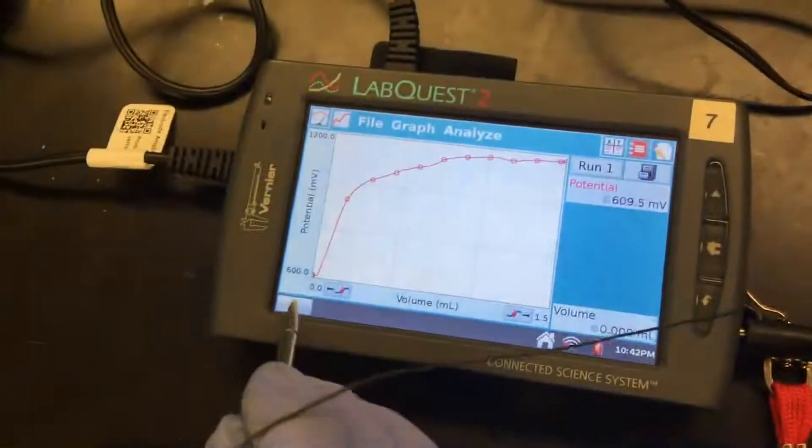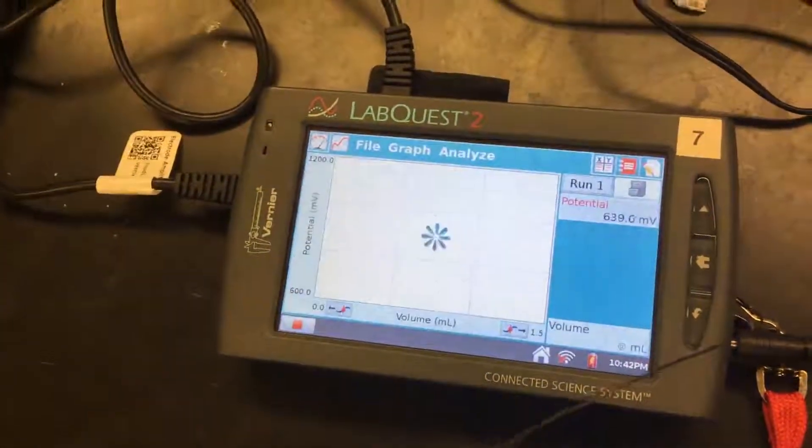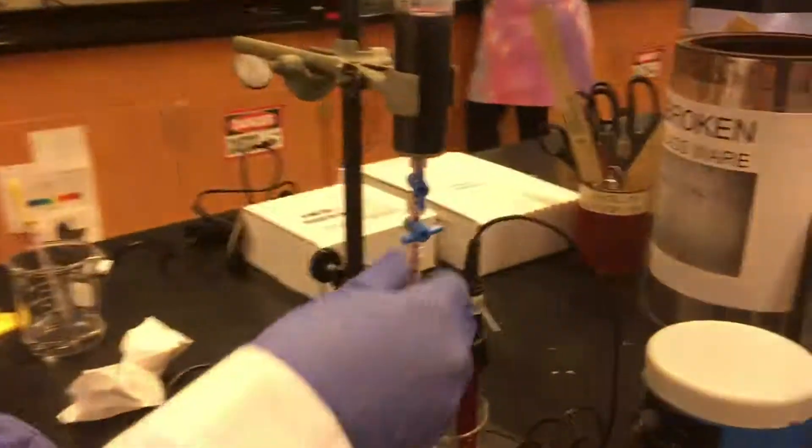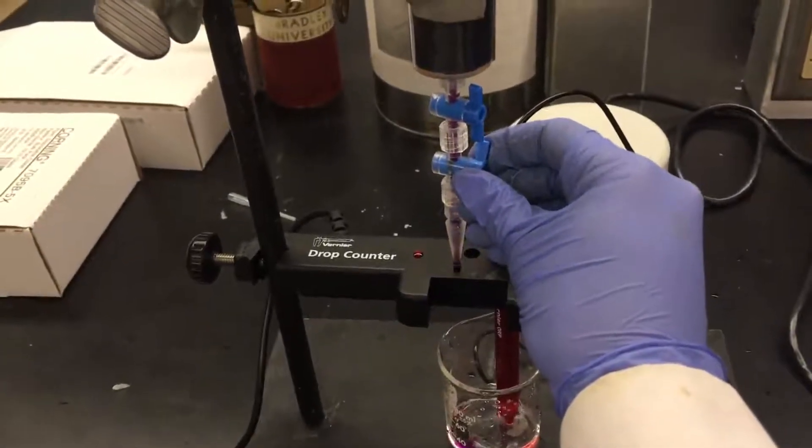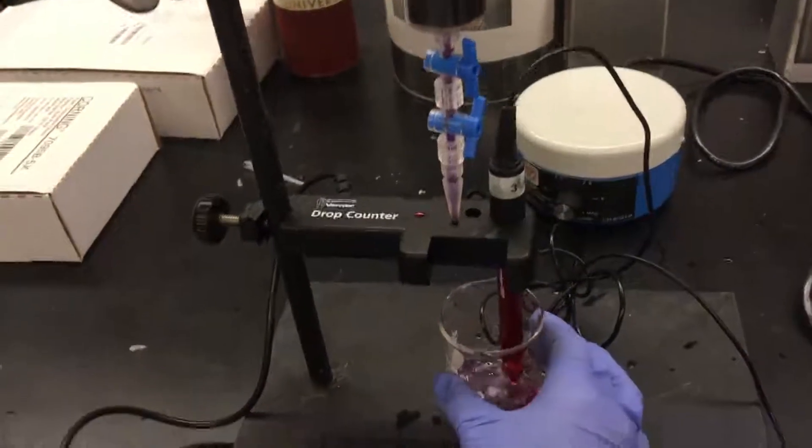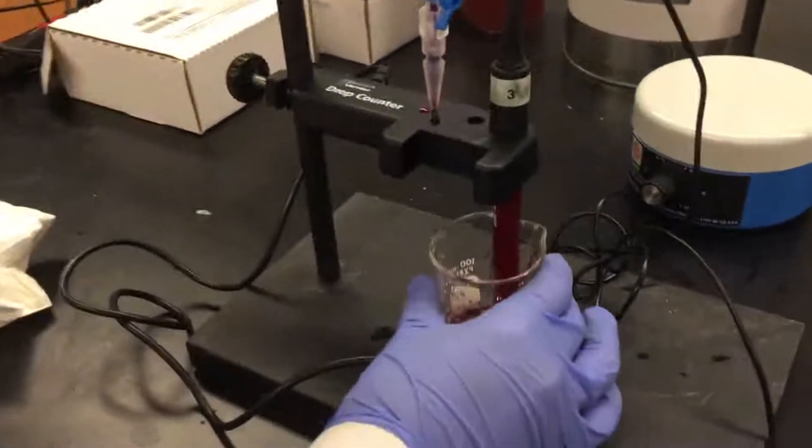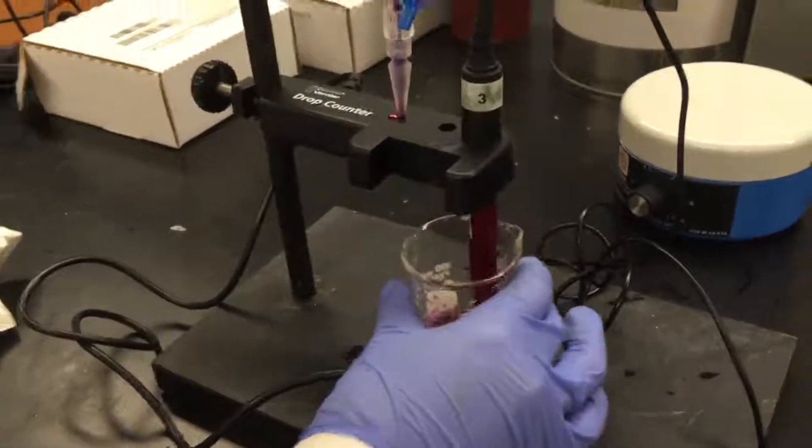So now Eilish is going to press play on the Vernier. And then we can start to run a new titration. So she's going to turn the burette valve, and then we're going to make sure that it lights up. Good, so the light is lighting up. And then she's going to hand swirl it to try and mix in the titrant into the solution.